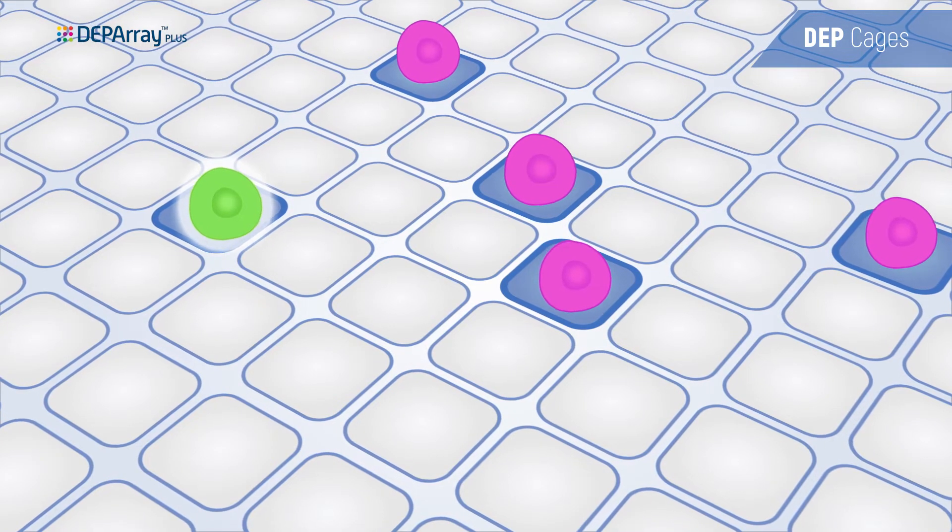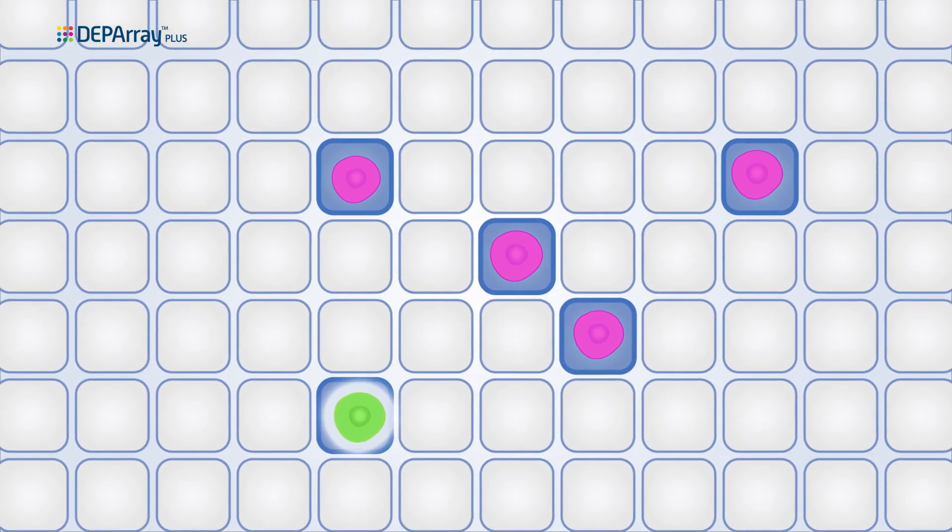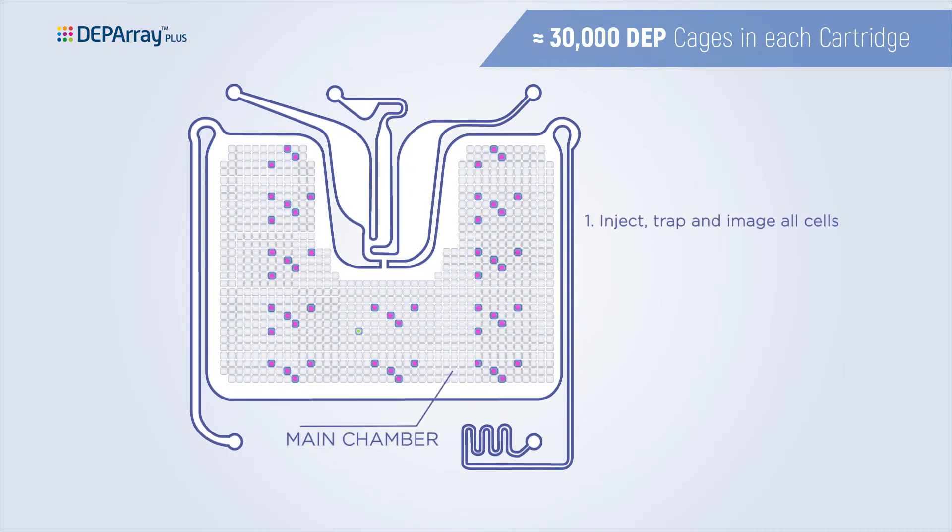Cells move from random suspension to orderly single-cell distribution in DEP cages in the chamber. Precise electronic control of cage motion in the microchip chamber enables outstanding performance in single-cell sorting.